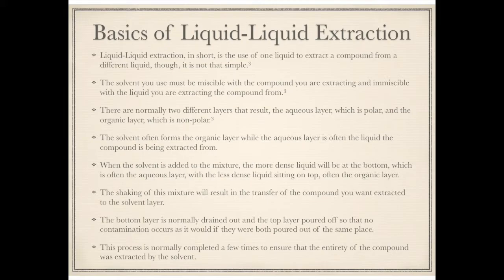The solvent often forms the organic layer, while the aqueous layer is often the liquid the compound is being extracted from. When the solvent is added to the mixture, the more dense liquid will be at the bottom, which is often the aqueous layer, with the less dense liquid sitting on top, often the organic layer.